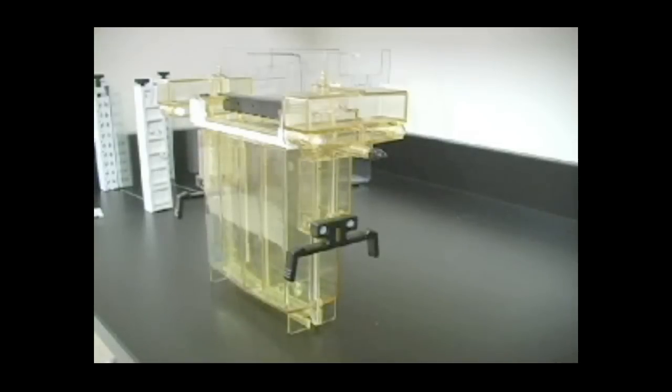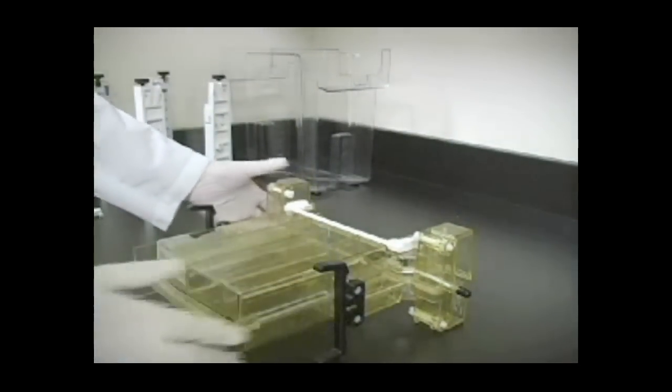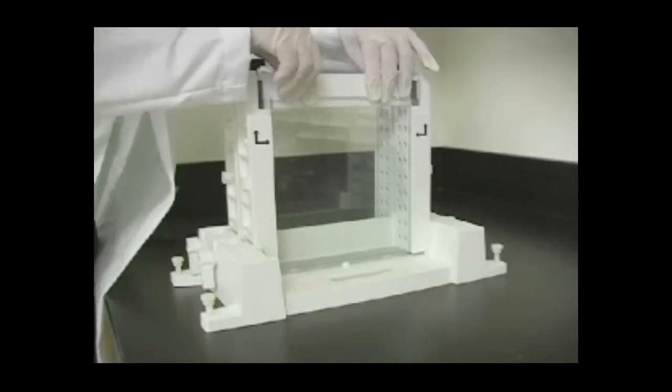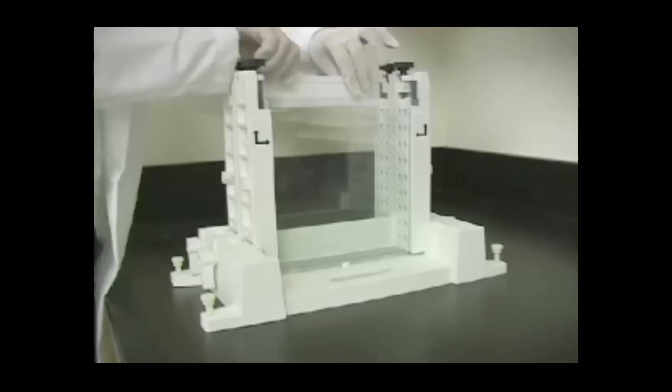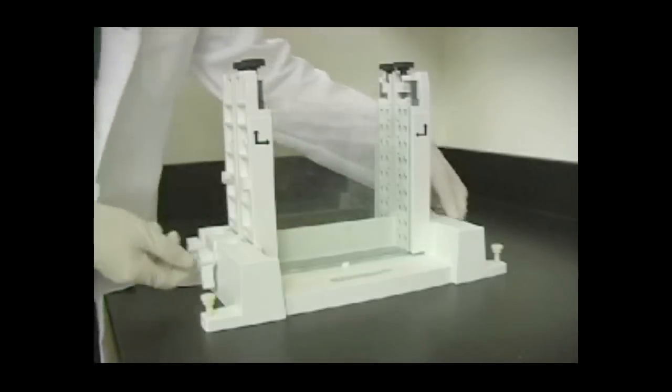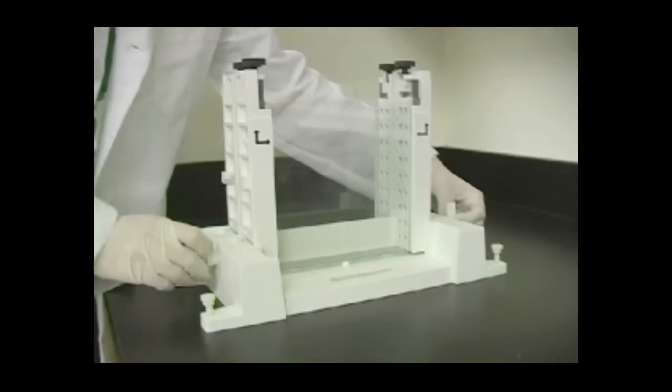Lay the central cooling core down on a lab bench. If applicable, remove the comb from the polymerized gel. Release the gel sandwich from the casting stand by turning the cams to the up position and pulling them outward. Pull the gel sandwich straight out of the stand.